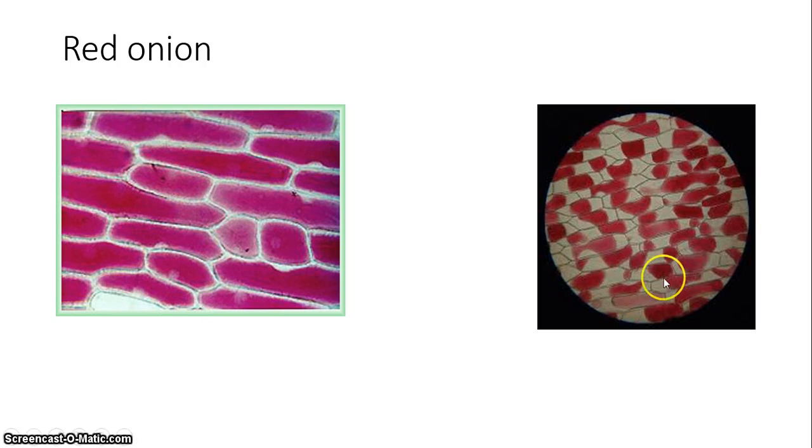This is a picture of some red onion cells that have undergone plasmolysis. These are cells in a salt water solution. Because there's a higher salt concentration outside of the cell — which means there's low water outside of the cell — the water inside is going to diffuse out.